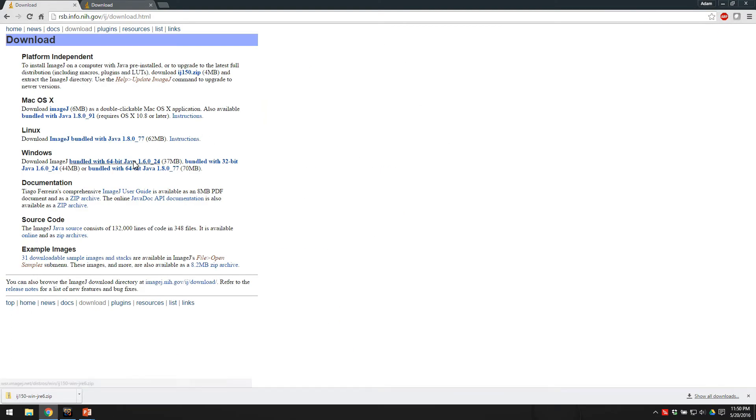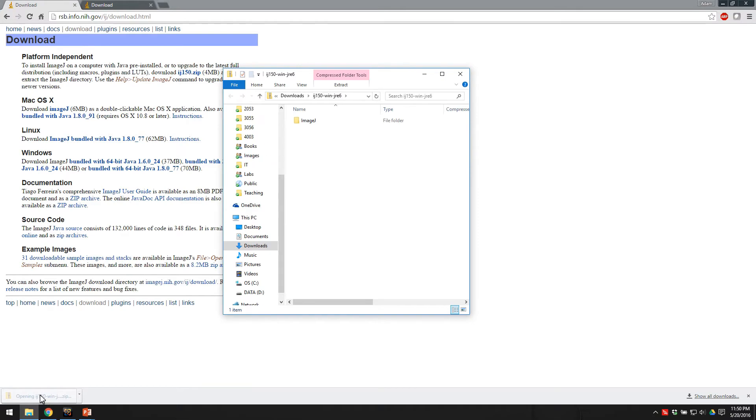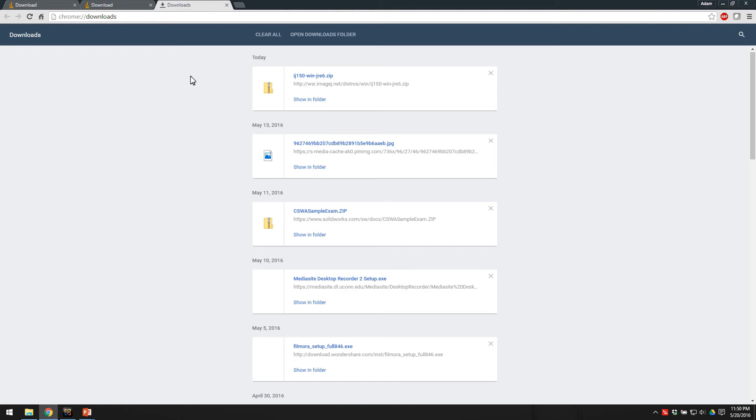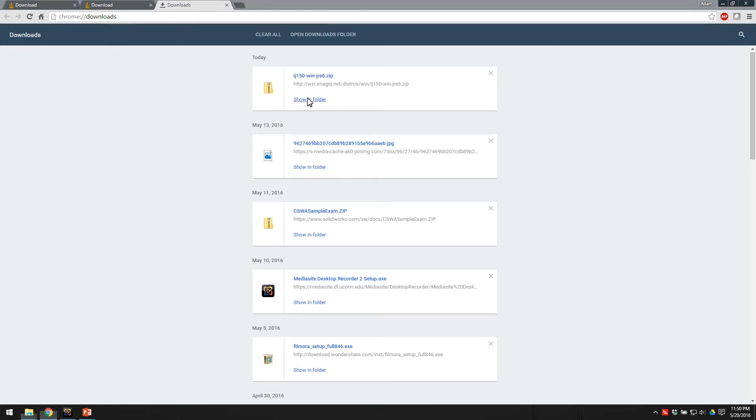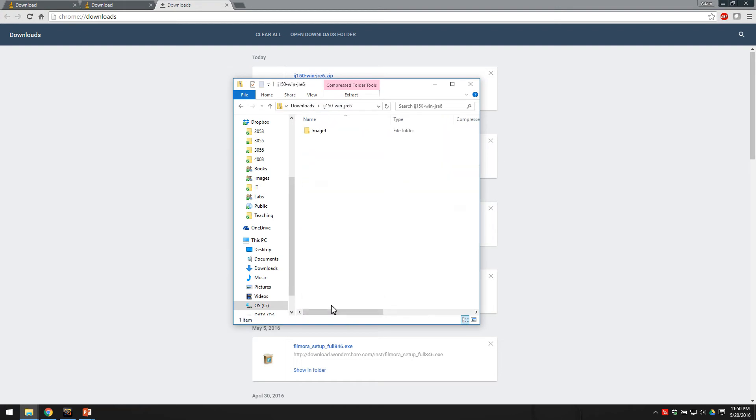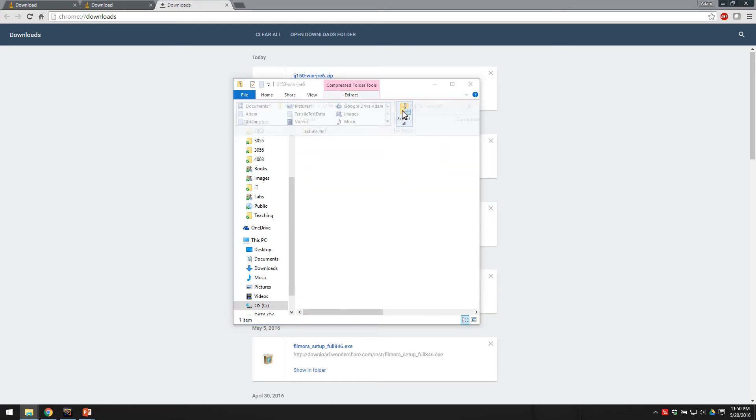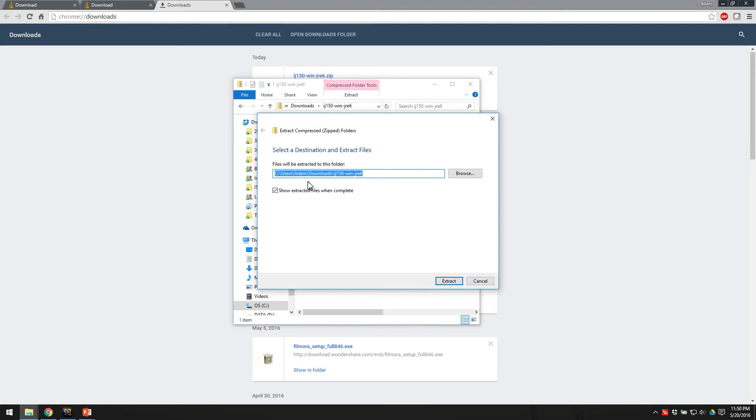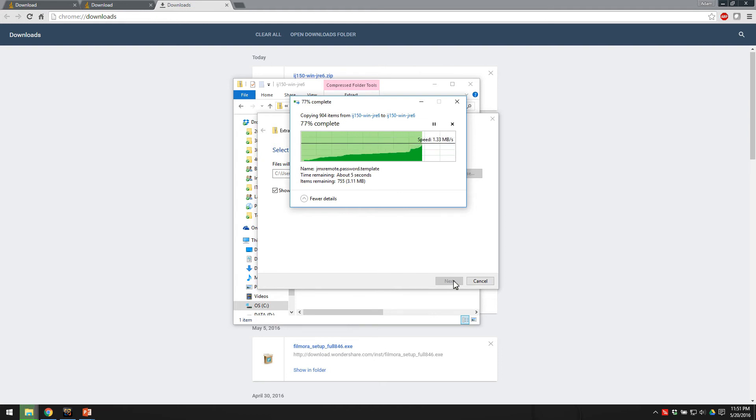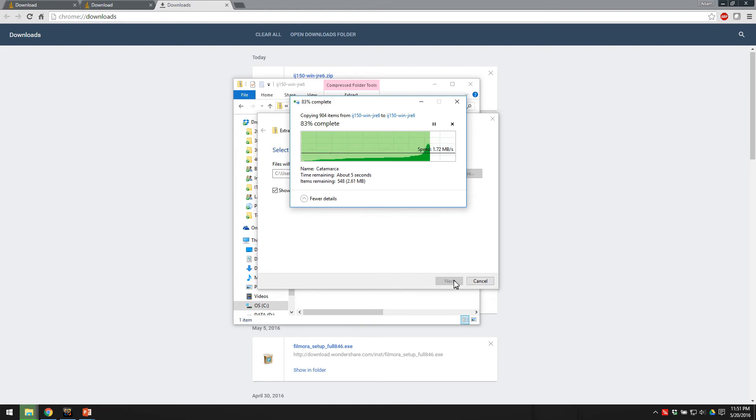So we've already clicked this, and it's been downloaded, so then just click on it in your downloads bar, or if you have to do the drop-down to look at downloads here, you can start it up there. If you double click that, you can extract all the files from that folder. It's not a really big program, so it shouldn't take too long.